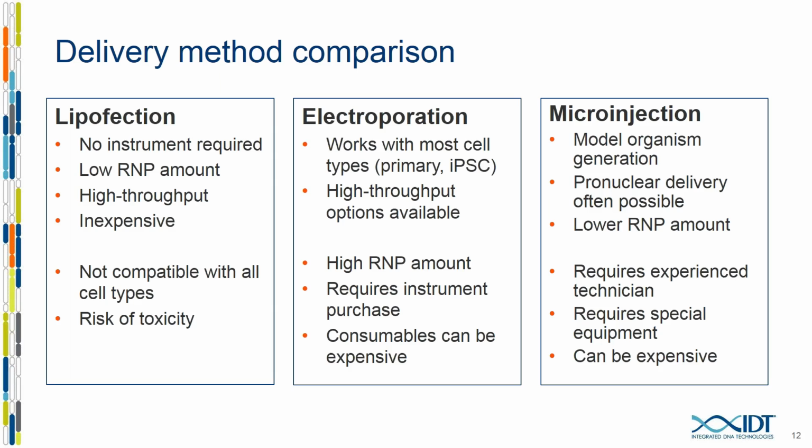With microinjection, it does typically require very good hands or experience having done many microinjections in the past. And you need the equipment to actually do the microinjections. So sometimes this can be a more expensive method as well.